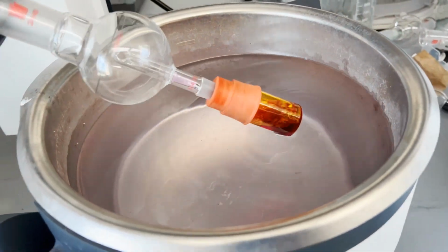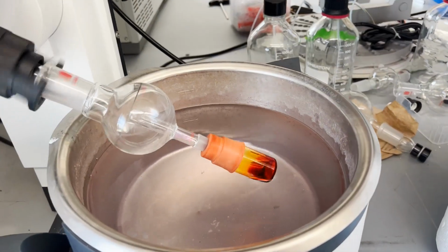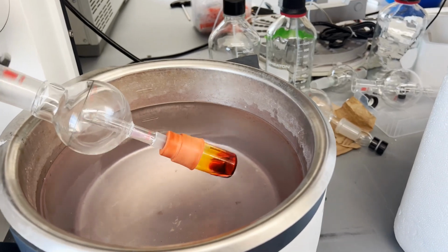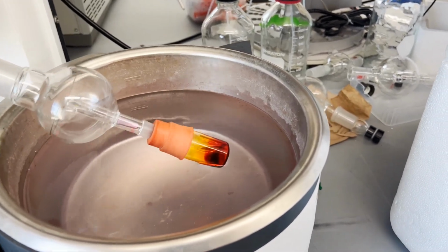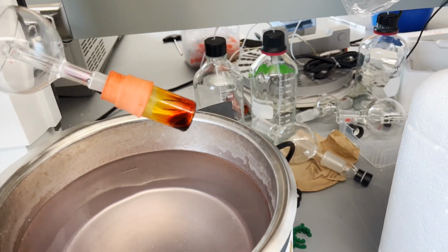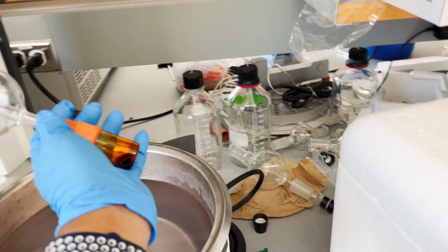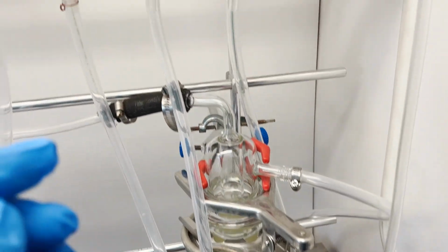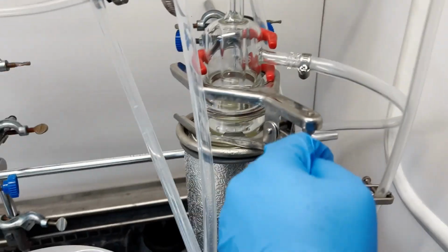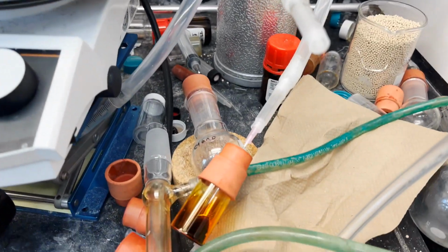Under vacuum pressure, the boiling point of the solvent always decreases, so ethanol or methanol can also be removed with the rotovap. And then you can use a vacuum pump to dry the remaining solvent. So here my rotovap is done. Still it is showing liquidish. This compound could be solid or liquid or gummy liquid. So now I am using my vacuum pump to dry the remaining trace amount of the solvent.